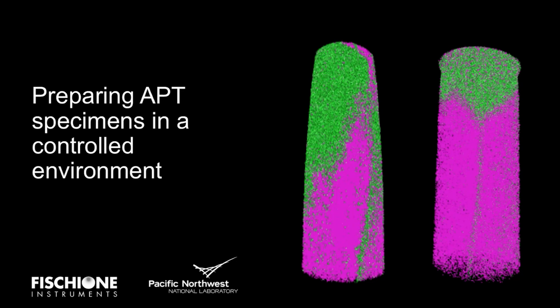Okay, the next question. What is the effect of ambient preparation and transfer in the case of EBSD analysis and APT analysis?